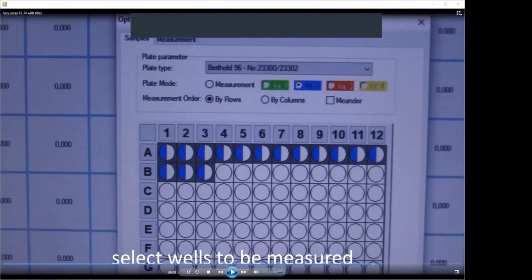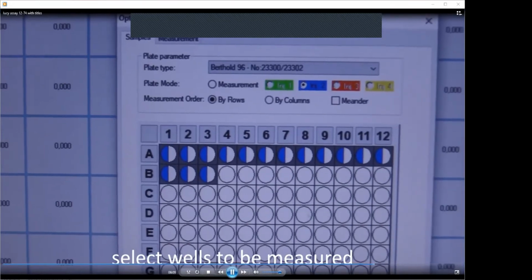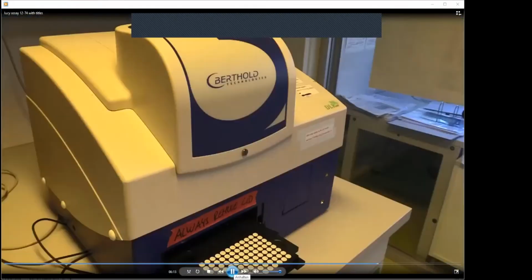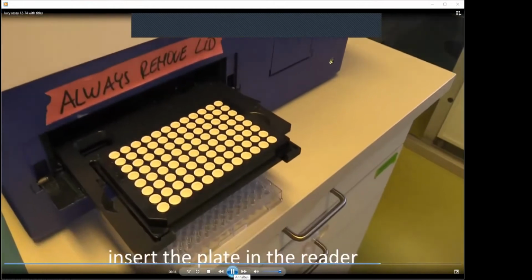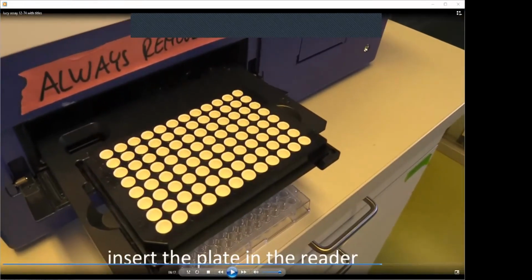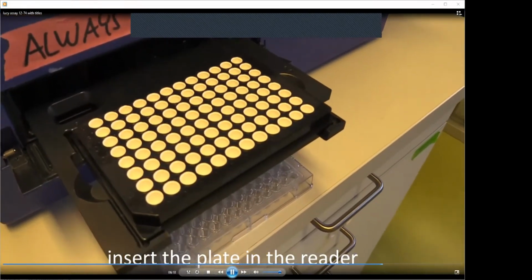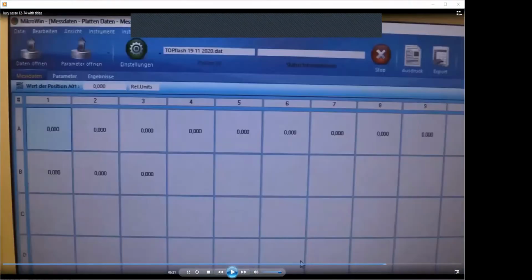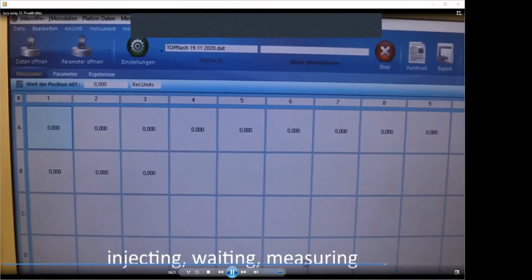Then you have to select in the software which wells have to be measured. So they are highlighted here. Then the injector is selected as number 2, which we have filled with the injection buffer. And then the measurement can be started by insertion of the plate into the reader. So this is our plate. Then you have to give the name to the file. So this was our experiment, and you start the run.